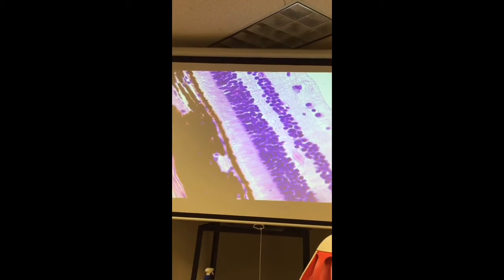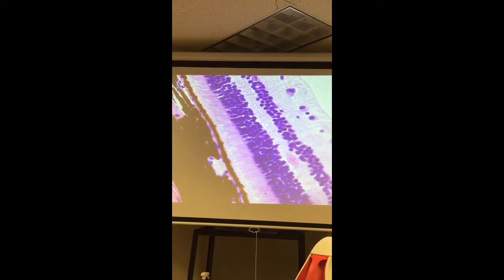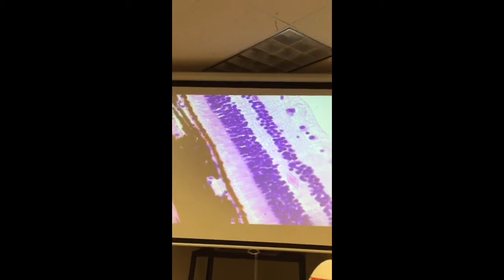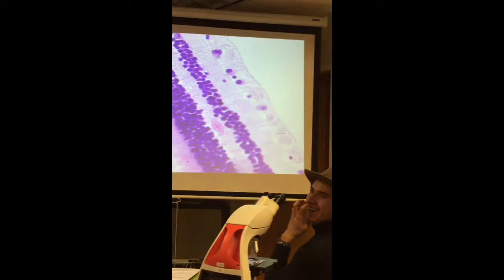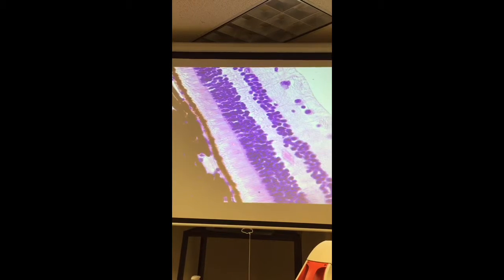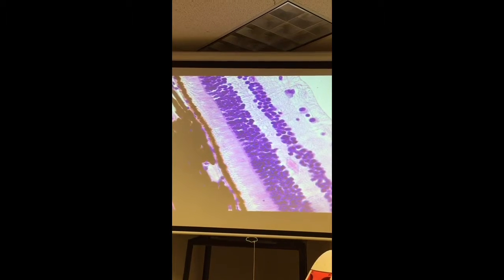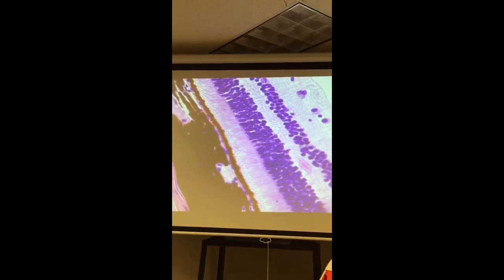This is an exteroreceptor, just to put things in, because light is on the outside of our body. And so then we look, identify this specific region. I'm sorry? Identify the specific region. That's not a region. Yeah, there were different regions of it. Oh, okay. Are we talking about like units?